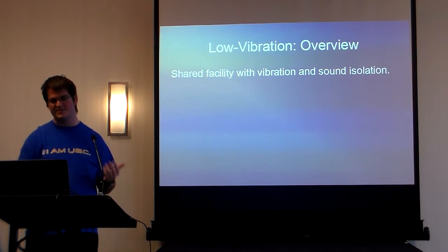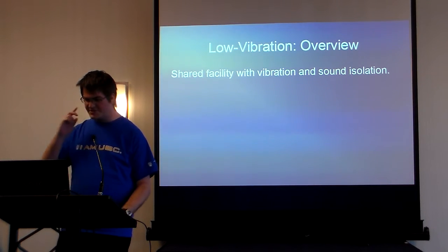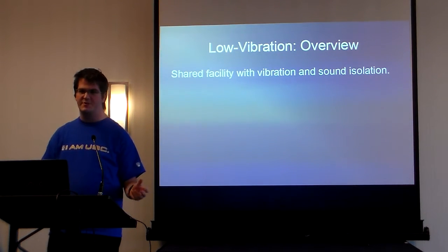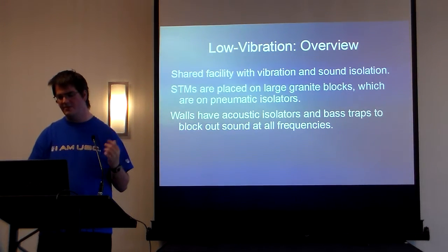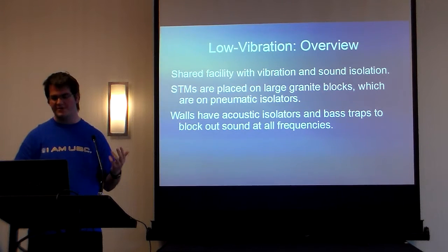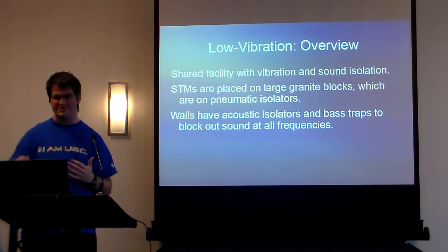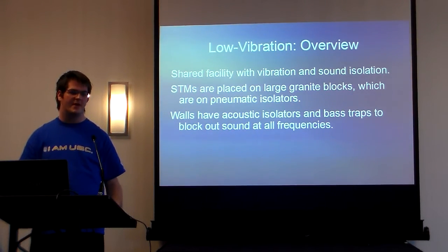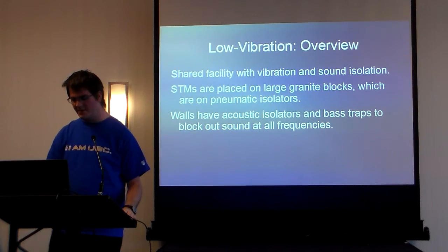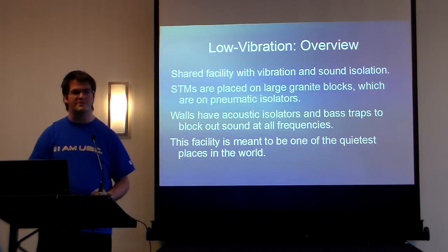And so this is the low vibration facility. This was just constructed this summer. It's a shared facility between 3 STM groups at UBC. And the STMs are placed on large granite blocks. These are on pneumatic isolators, so all the mechanical vibrations are cut out, and the walls have acoustic insulation to make sure that a lot of sound is cut out. And so this is meant to be one of the quietest, noise-free places in the world.